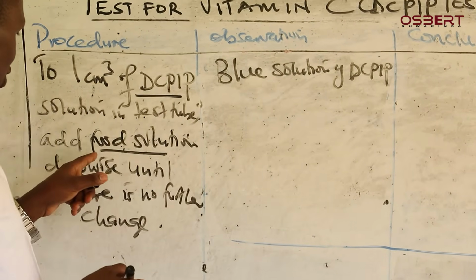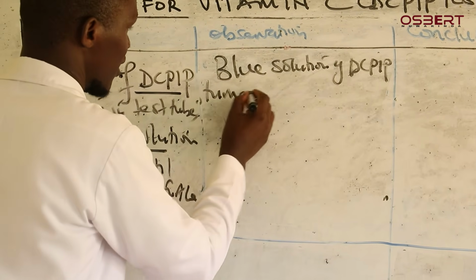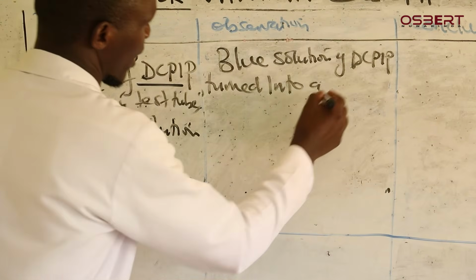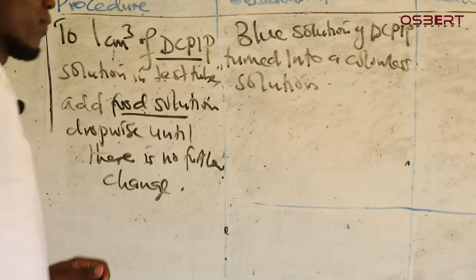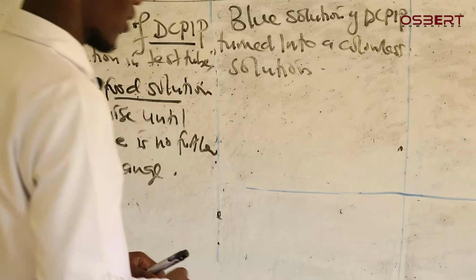Well, after adding drops until no further change, what happened? It turned into a colorless solution. So that's the observation as far as vitamin C.